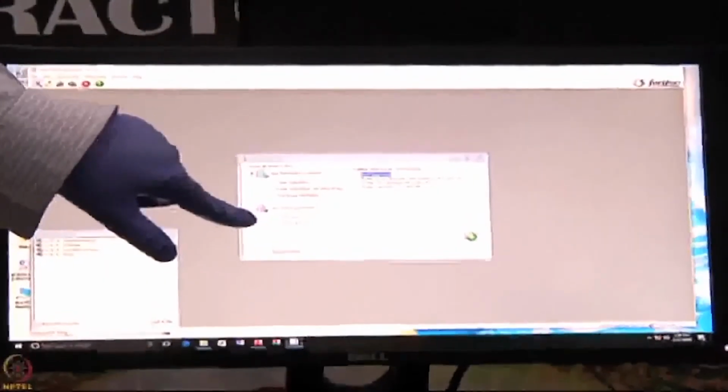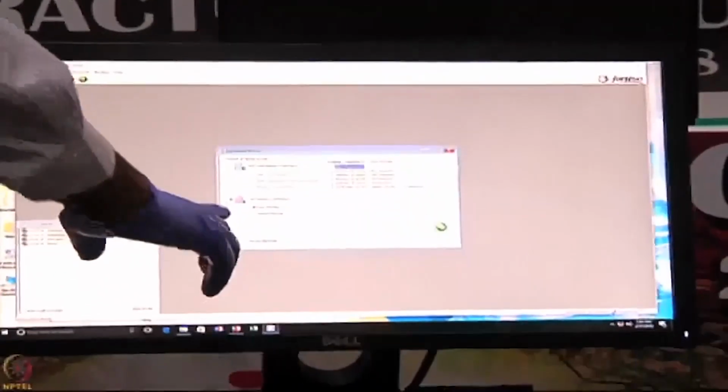We can do epitope binning also. There is one more software for that. So I will now check the kinetics experiments. Here I am clicking on it, then on the screen I have to say go.